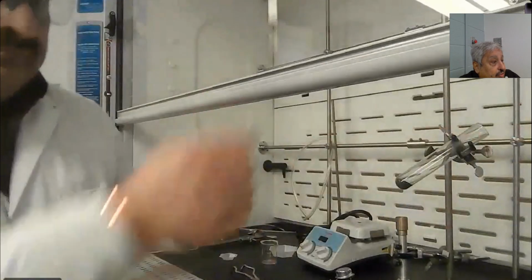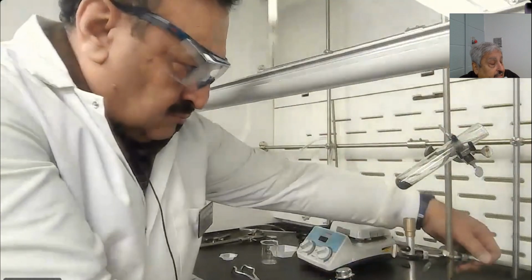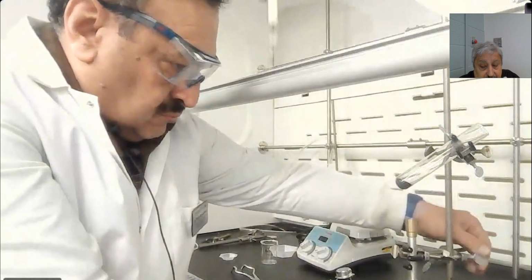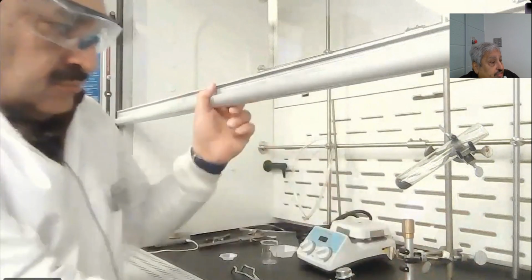You will not do anything while the flame is on. Flame has to be off. Set up everything, and then you can turn on the flame if everything is set up, because that's a safety problem. And that's what I do first.